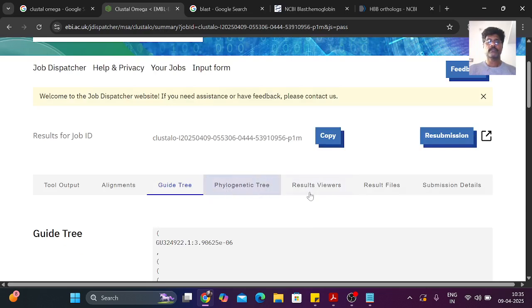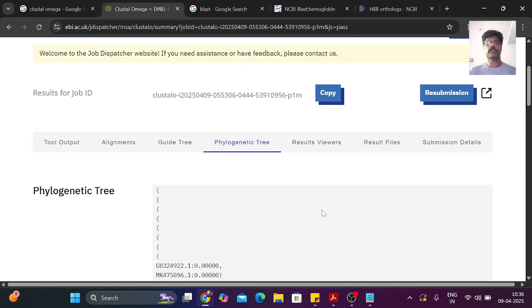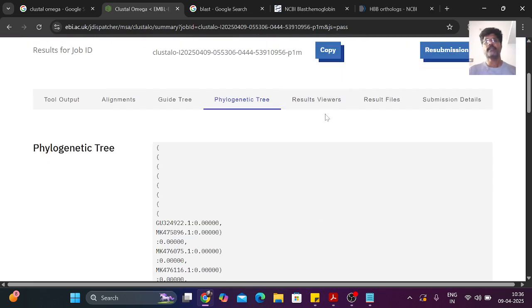And the same results we will get here also, but I hope this is not responding. See that the scales only get expanding, but it is not responding to me. Okay, leave it. But I hope you can get the result, right?